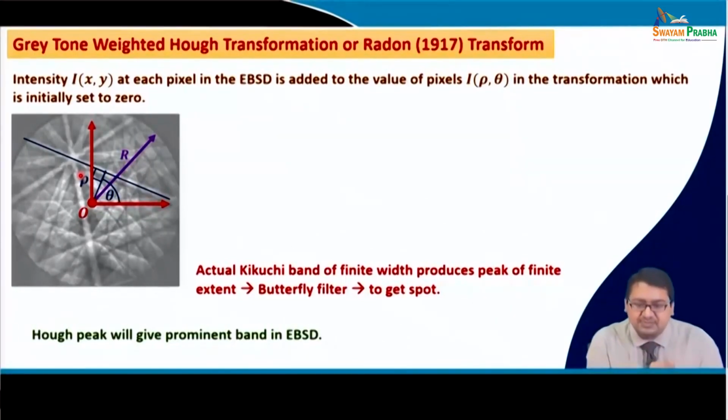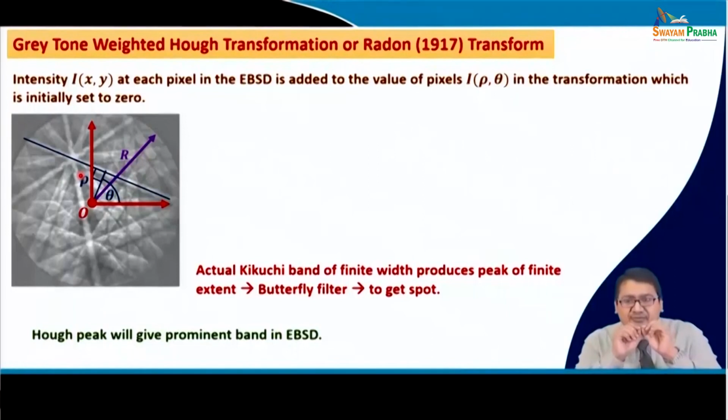Now, you see the actual Kikuchi band of a finite width produces a peak of a finite extent, right.